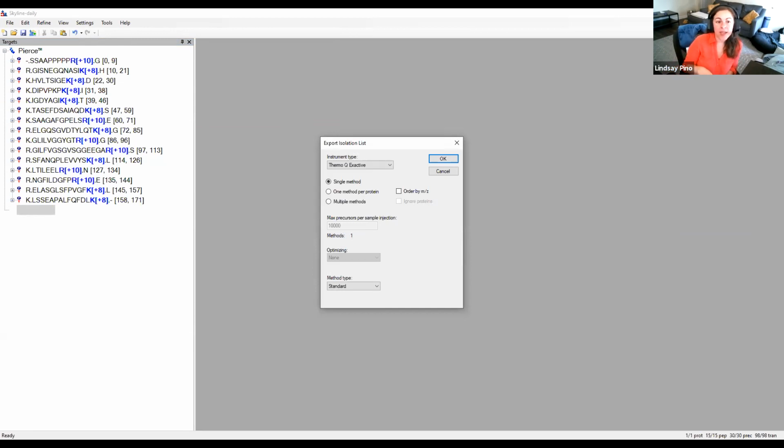So I have in that document, I also have instructions for setting up an instrument method. It is just for Thermo. That's all I have access to right now. But if you have any questions in that tutorial, let me know. And I think I'm at my 30-minute mark, so I will pass it over to Josh. But yeah, we'll have more questions. I'll answer what questions I can in the chat and make sure that you have the link to the tutorial.